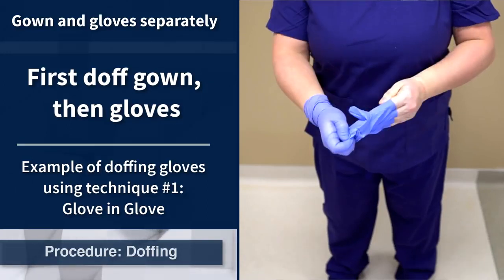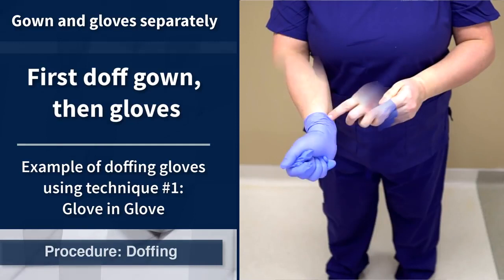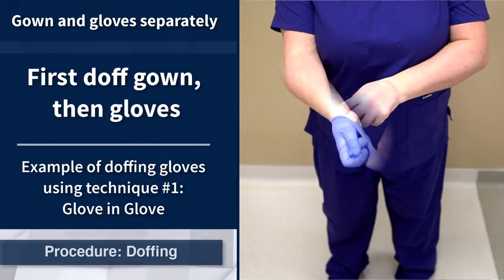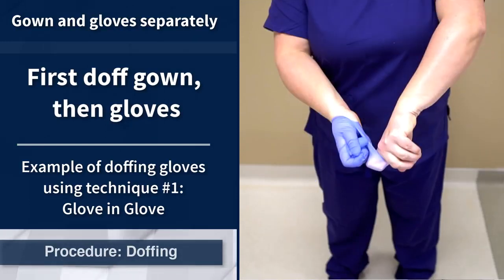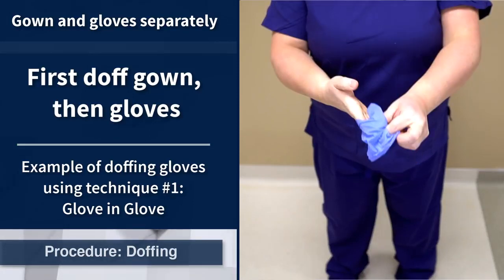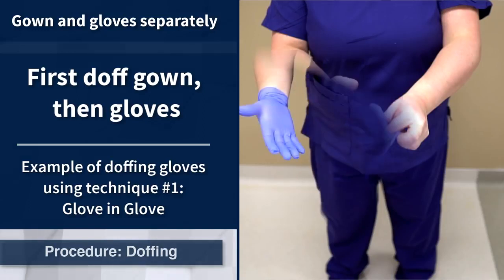Hold the removed glove in the gloved hand. Slide the forefinger of the non-gloved hand into the wrist of the other glove and pull it off. Make sure to only touch the inside of the glove and that the glove turns inside out and envelops the other glove.